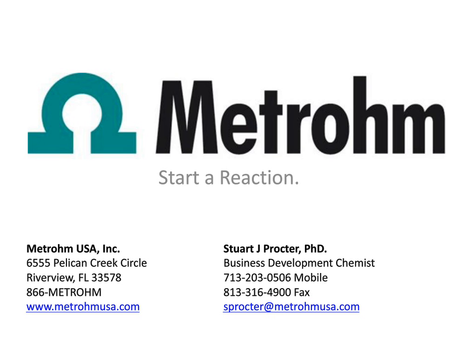Yeah, I'd like to add to that. Basically, the market trend is, as instruments become more sensitive and more powerful, we can introduce less and less sample and still achieve the results we want. Of course, if you're injecting smaller amounts, then there's less matrix to deal with in the preparation and purification step. So all of these methodologies we talk about have a capacity on what they can actually remove. So obviously a smaller sample means you can get more samples per, well, in terms of capacity in preparing the sample for injection.